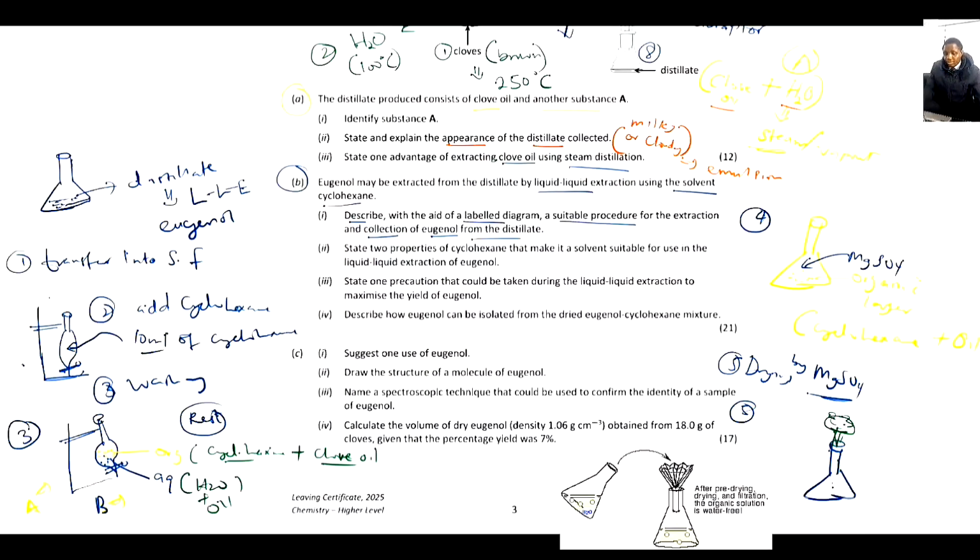So for the gravity filtration, GF. Am I writing? Gravity filtration. So we have gravity filtration here. You put your solution, you bring it now. For gravity filtration, that's step 6. After you've removed that, then you carry out step 5.